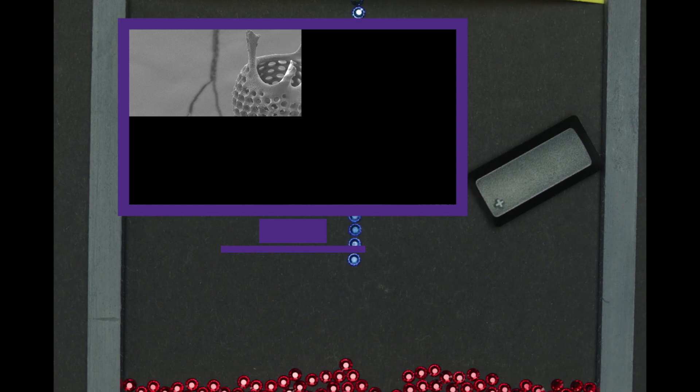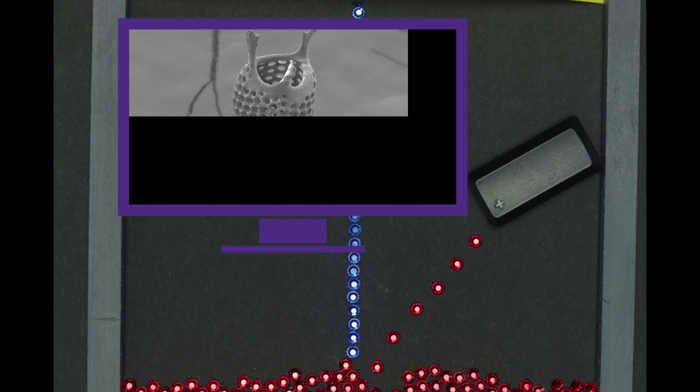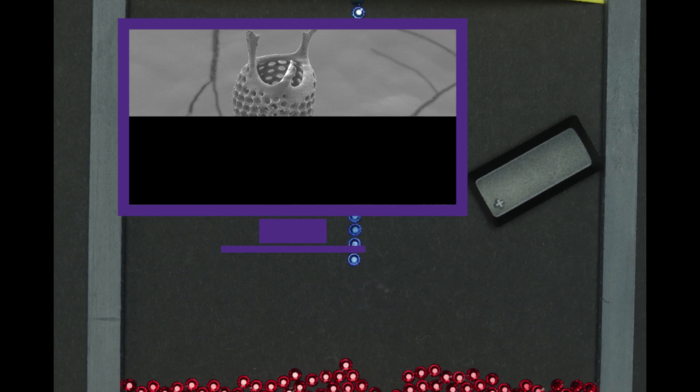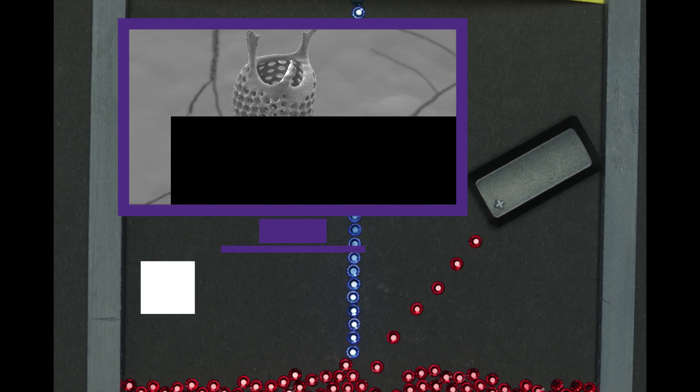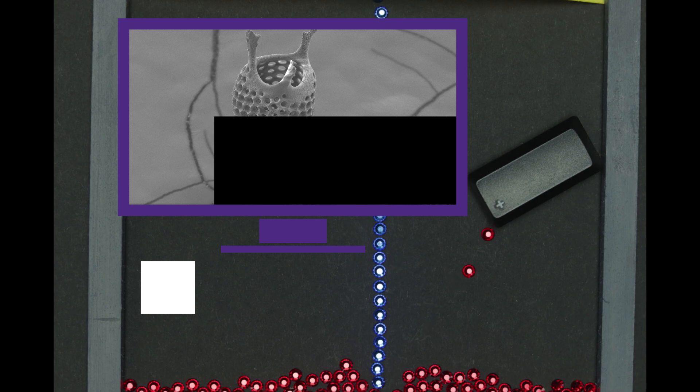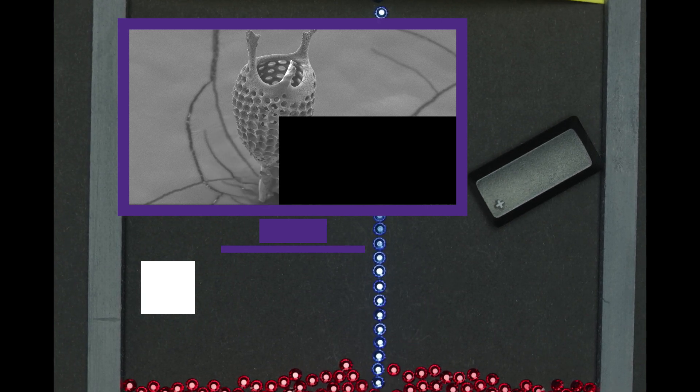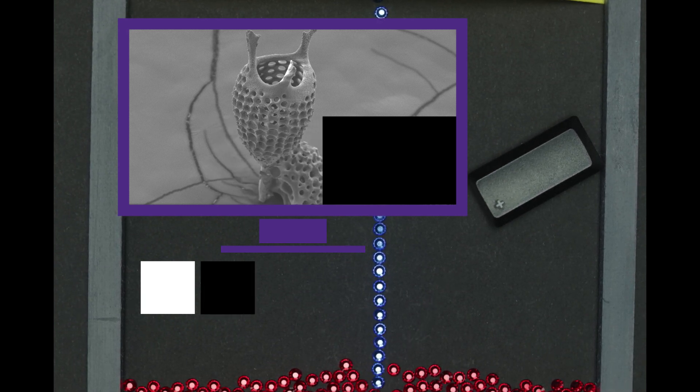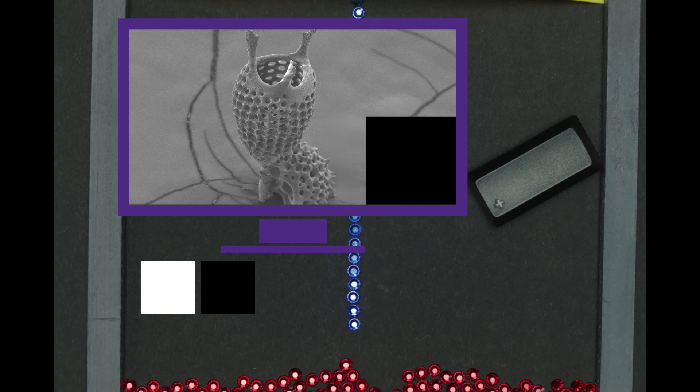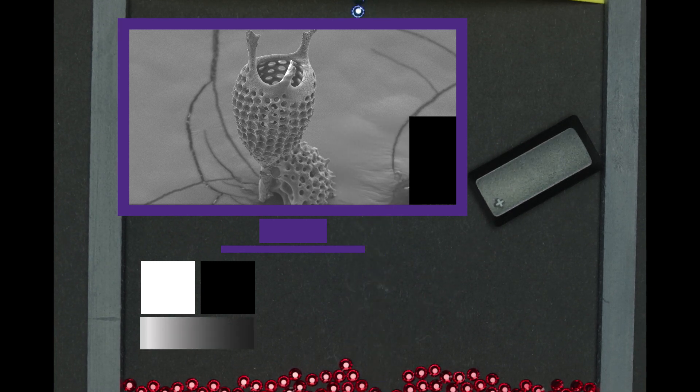When the electron beam hits the surface of your sample many secondary electrons are released. The computer interprets this as a white point. When the electron beam hits the bottom of a pit few secondary electrons are released. The computer interprets this as a black pixel. From there anywhere in between you will get different shades of gray represented in the pixels.